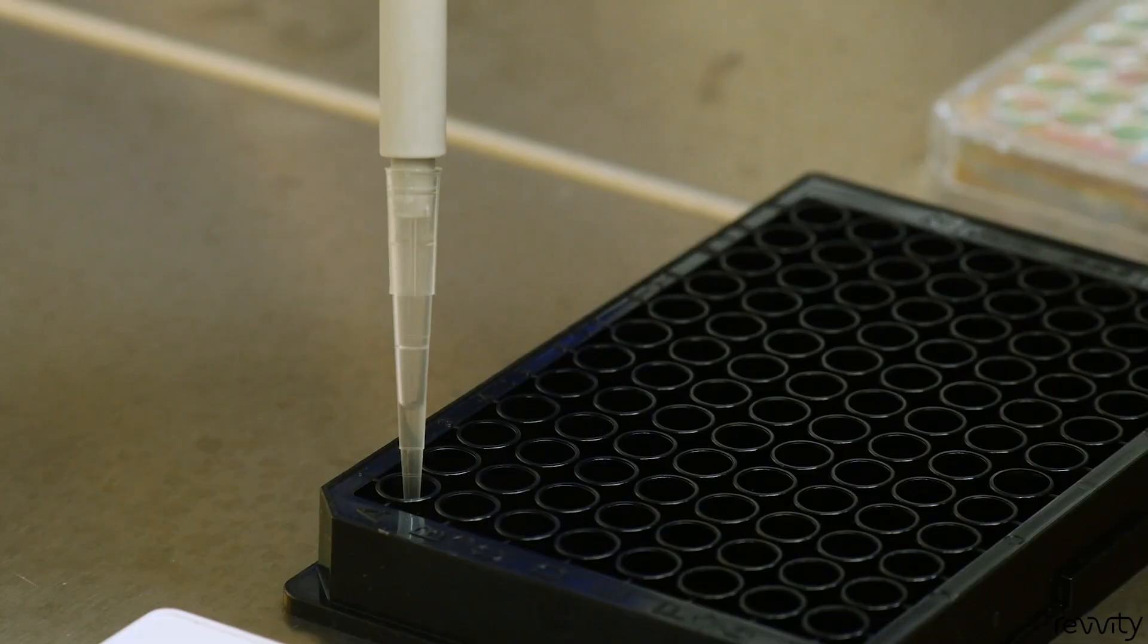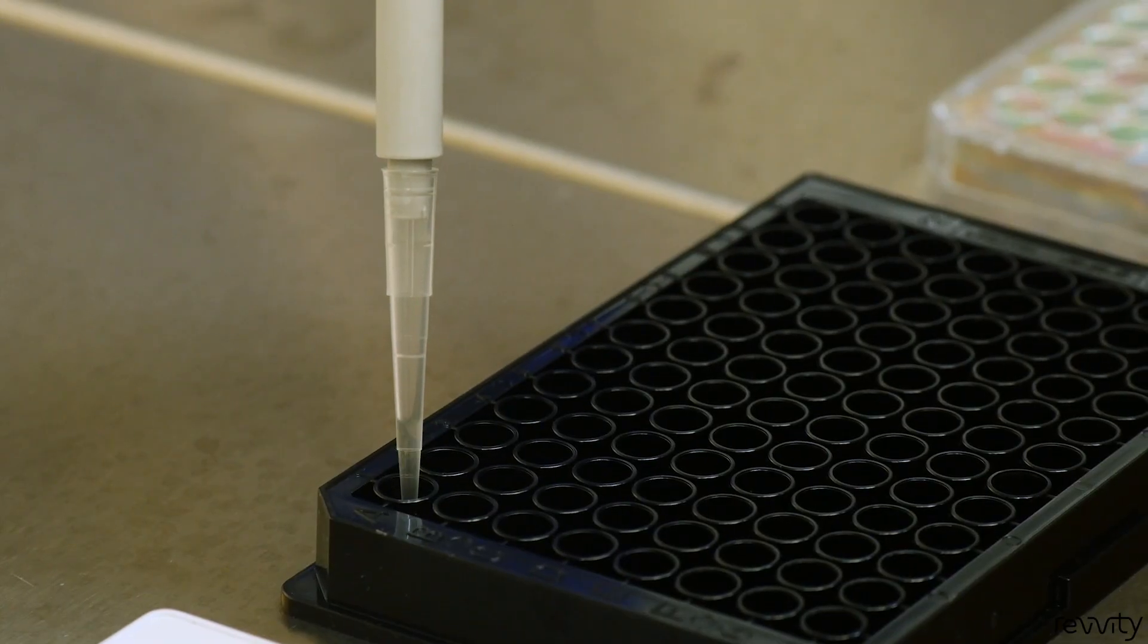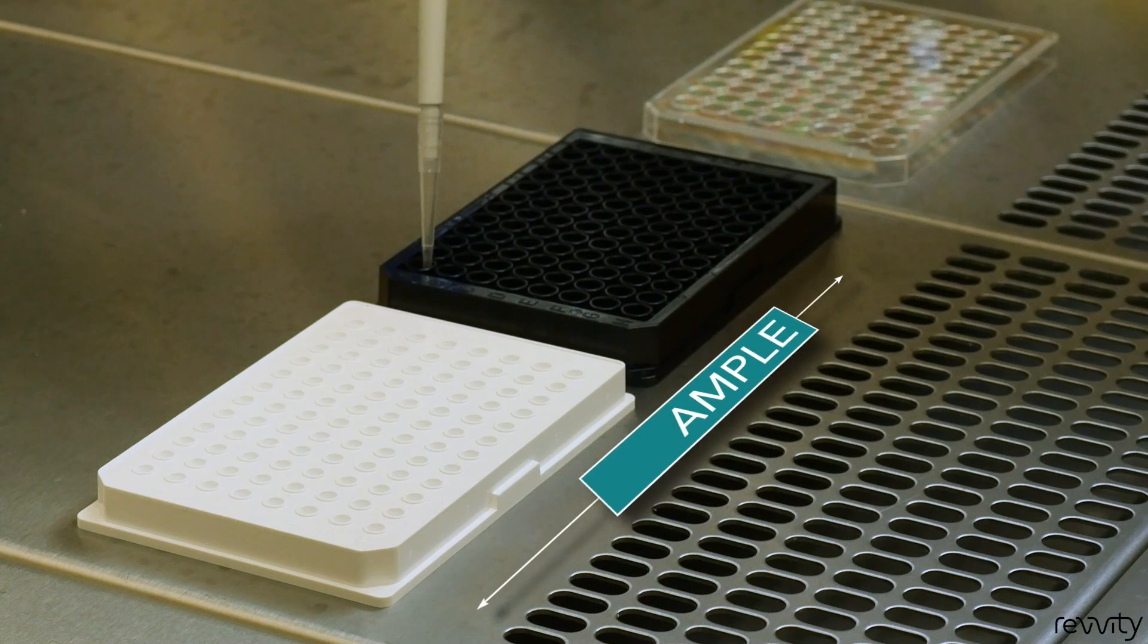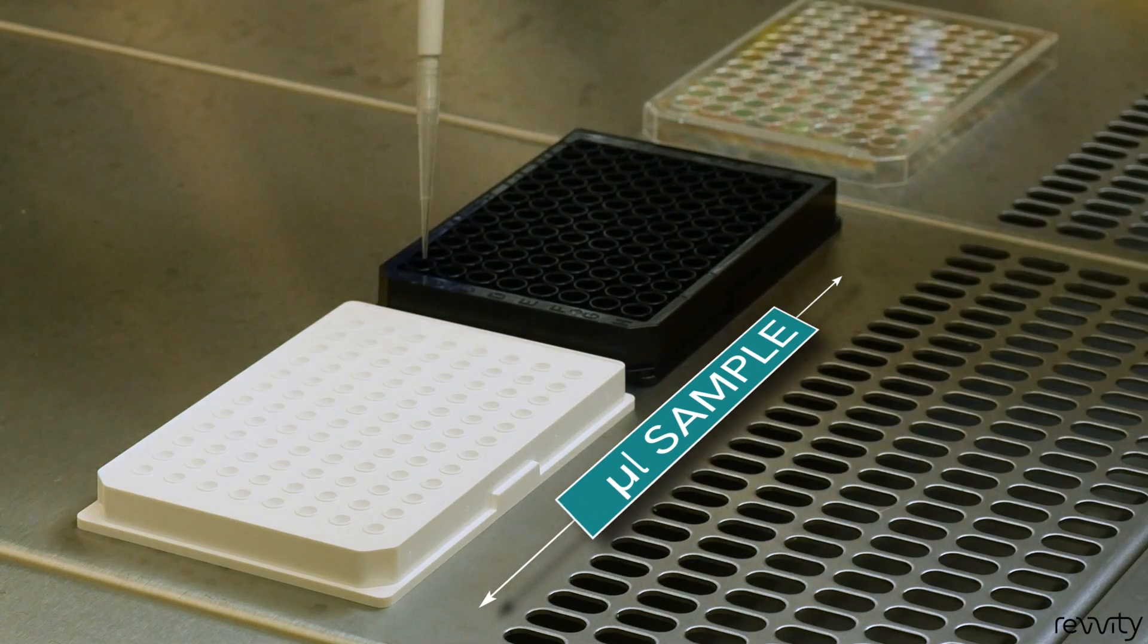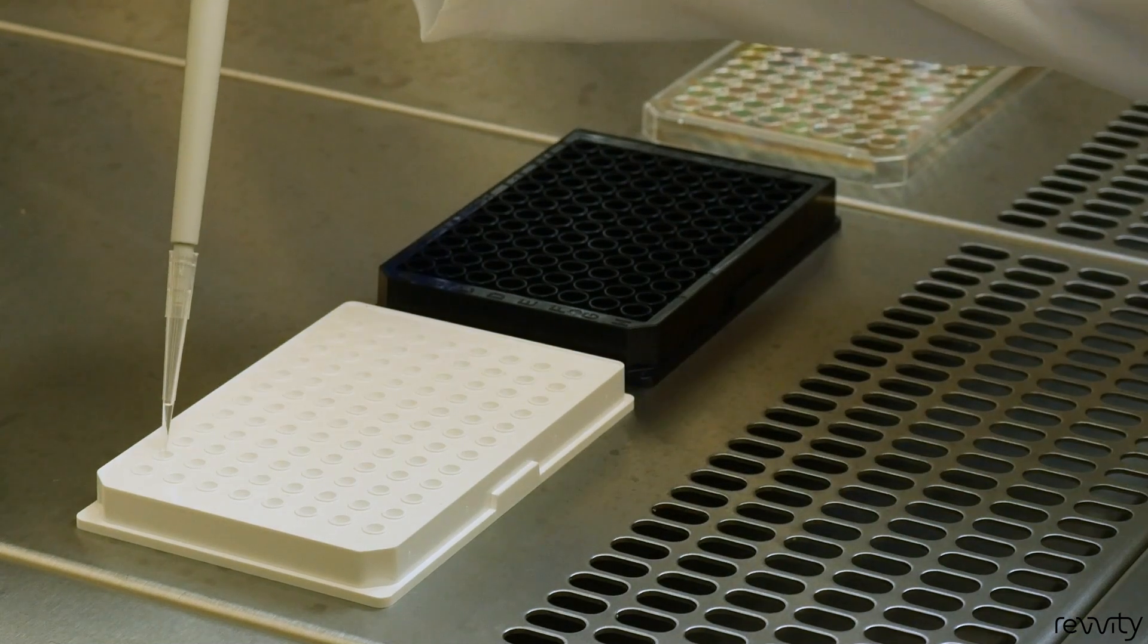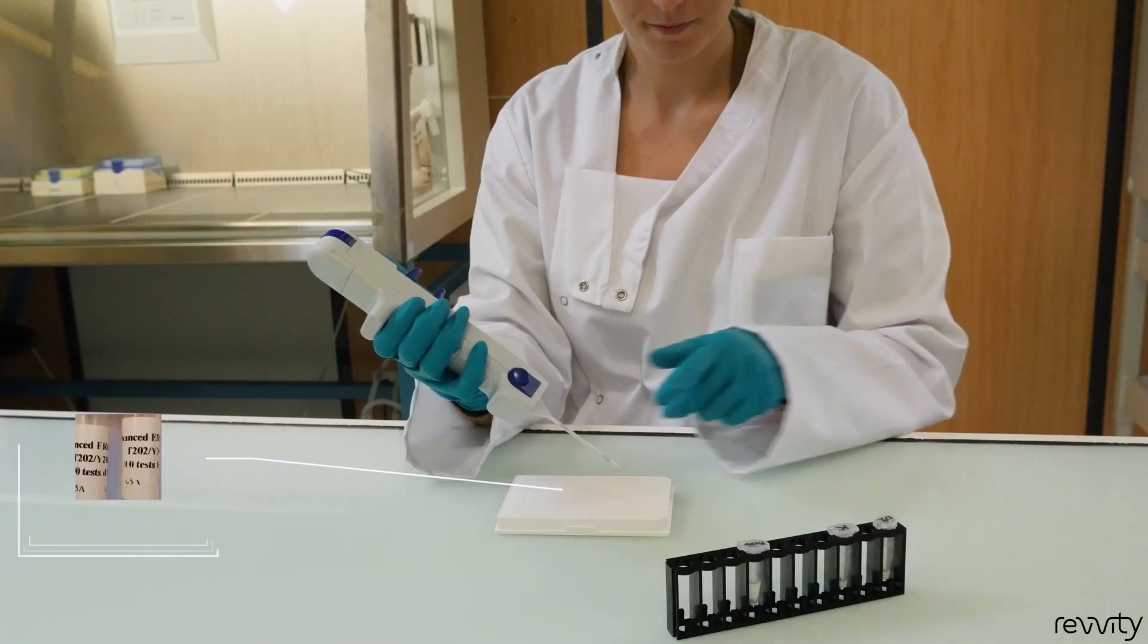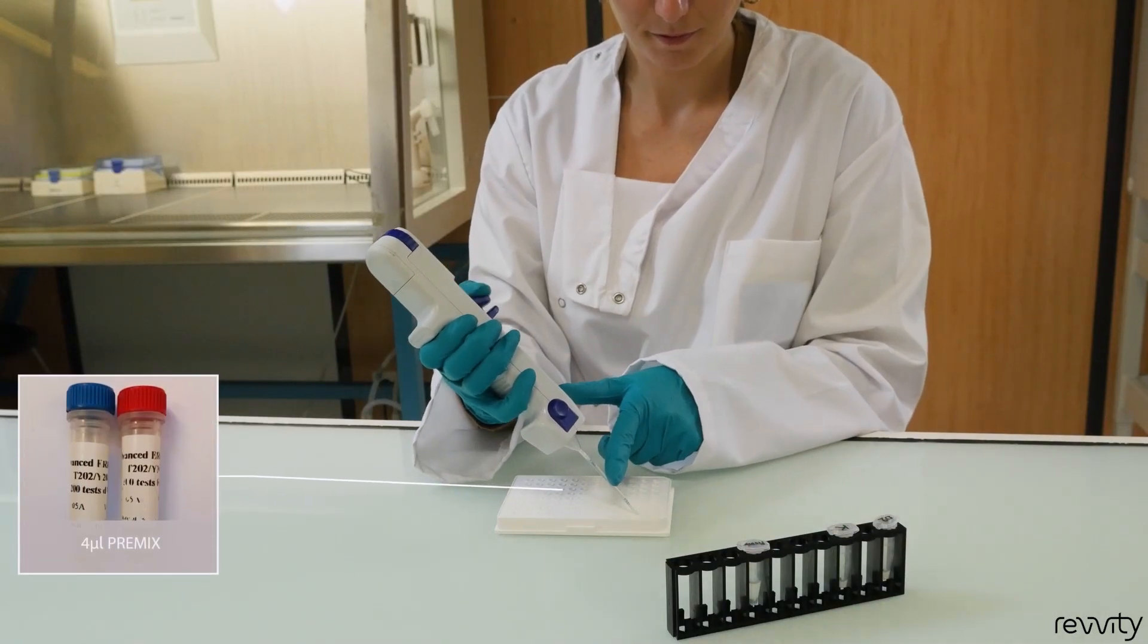After lysis, homogenize your lysates by pipetting up and down. Transfer 16 microliters of the lysate from your culture plate to your HTRF detection plate in duplicate. Add 4 microliters of pre-mix detection antibodies.